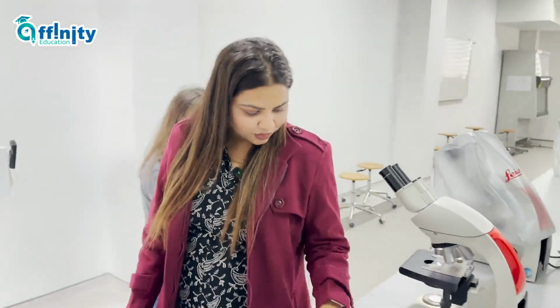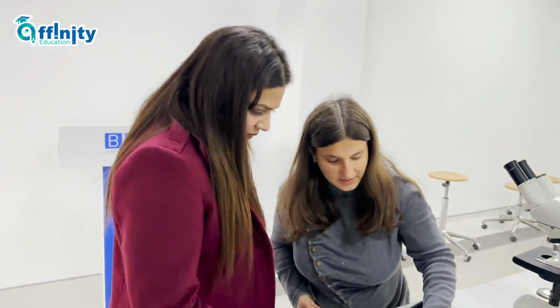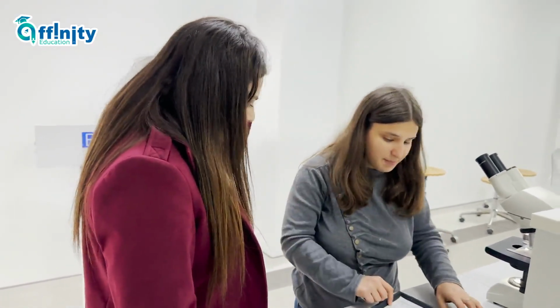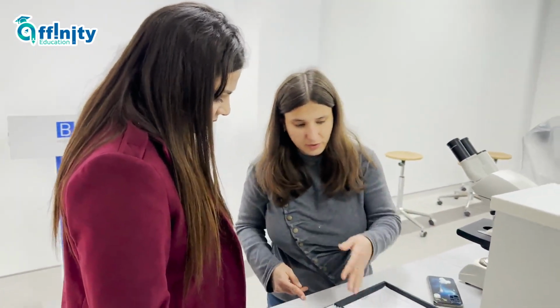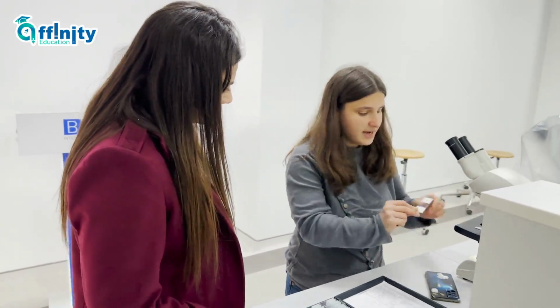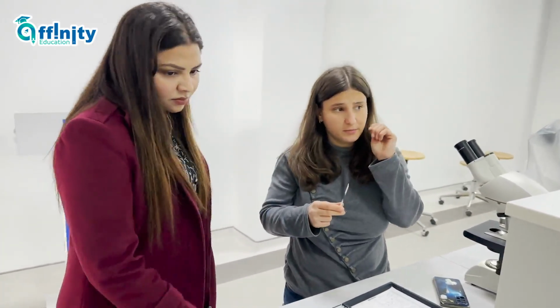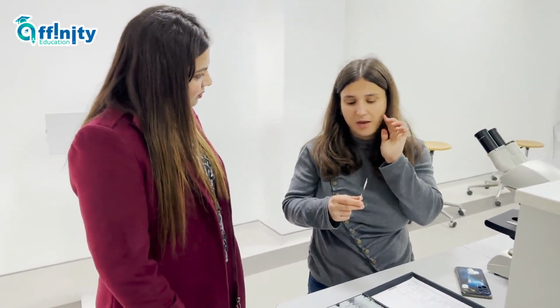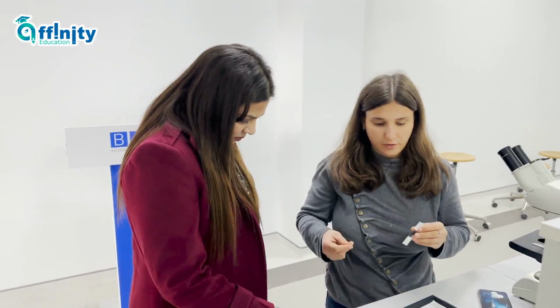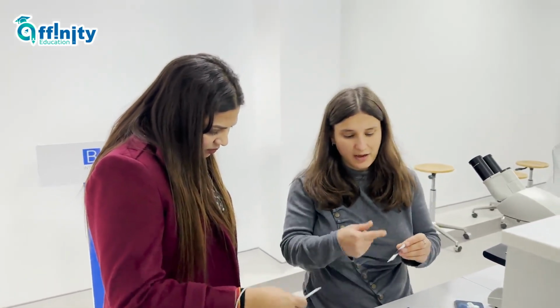And what is this? This is micro slides. Okay, micro slides. This is fixed micro slides. This is a microbiology lab, but sometimes we are doing a histology lab also here. In microbiology labs, micro slides are alive. They are not fixed. So sometimes we are taking some microbes from the mouth or, I don't know, from blood, and we can see it, but teachers are doing it and not doing it. That's why we don't have it now.